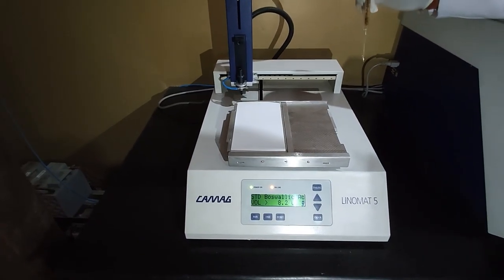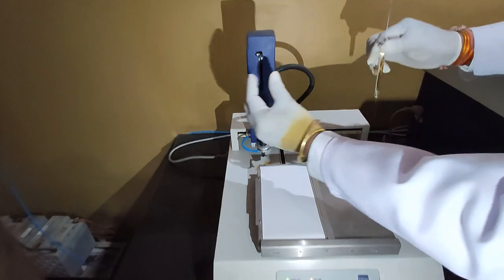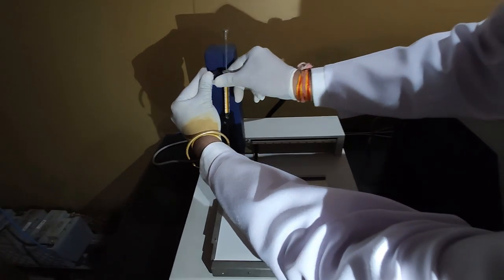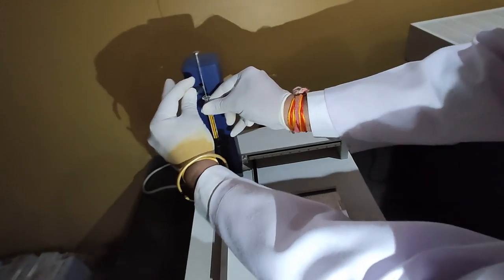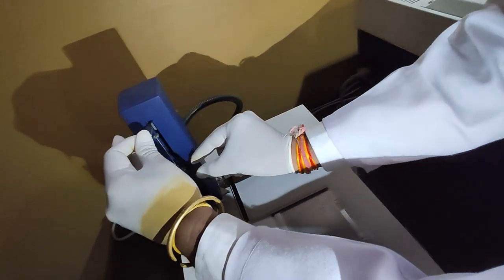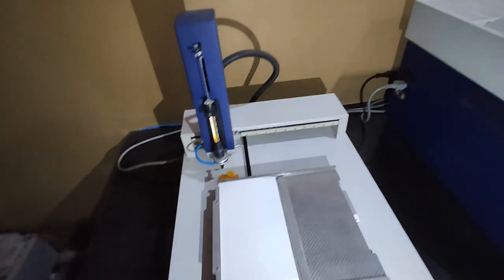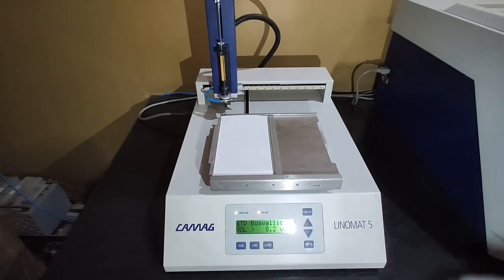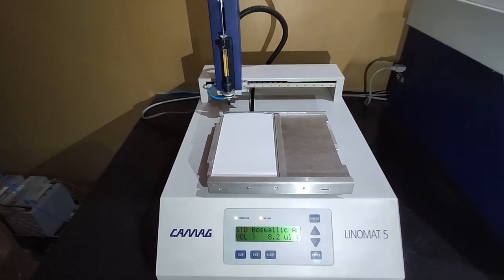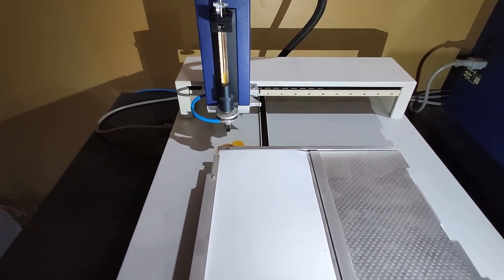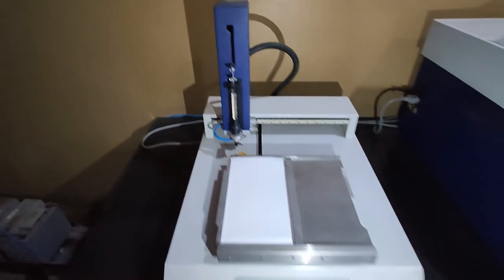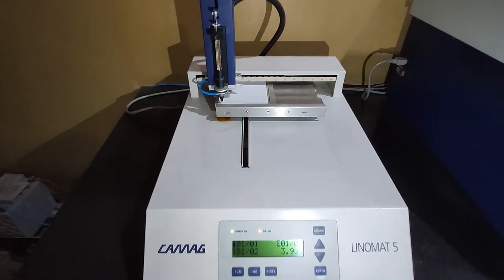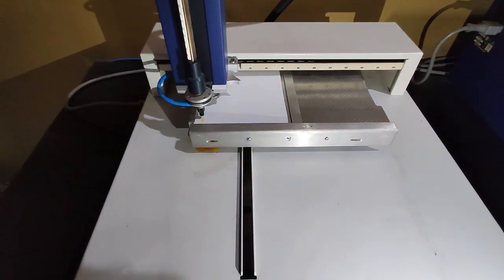This is the sample injector. With the syringe, samples are spread on HPTLC plates in the form of bands. This sample injector is connected with nitrogen gas.